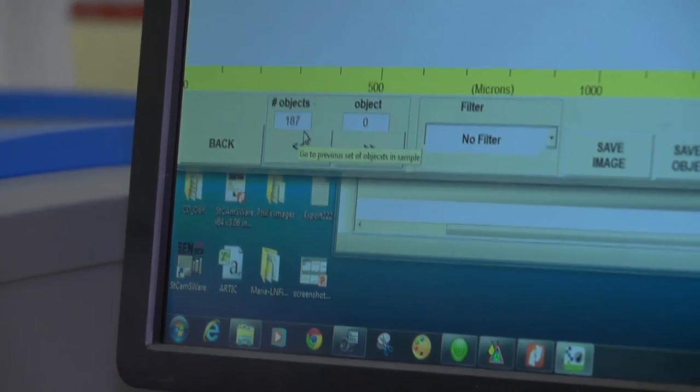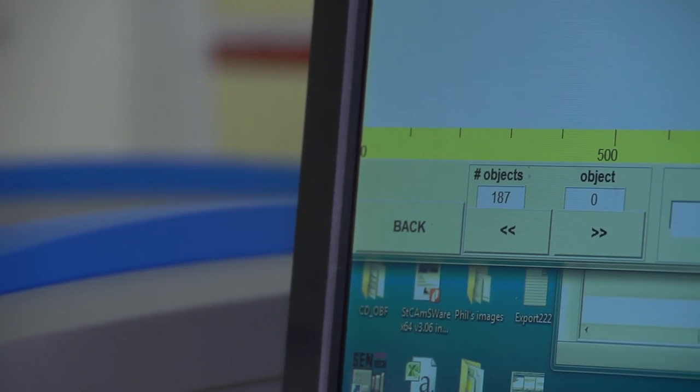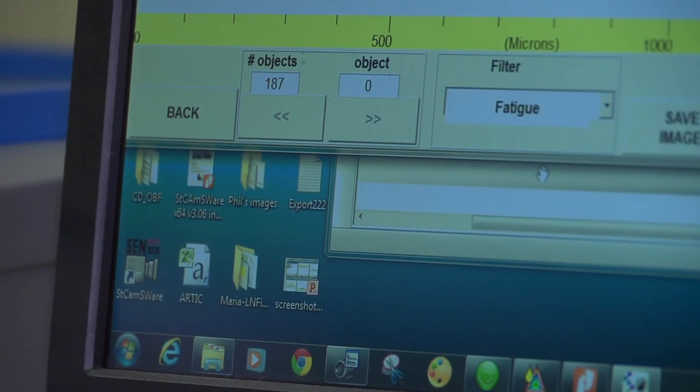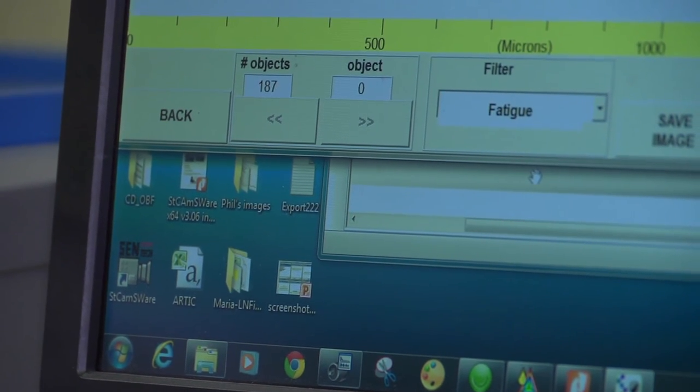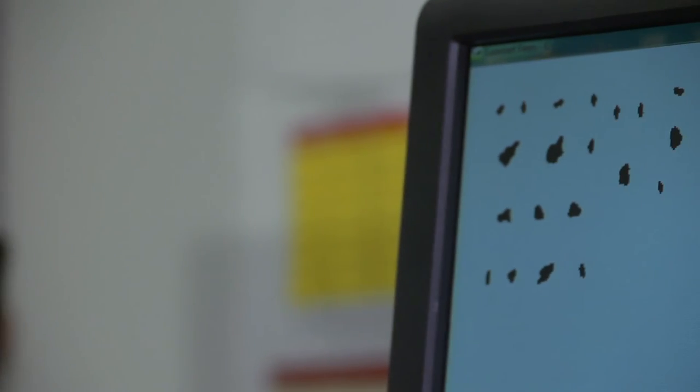And then you can actually filter if you're only interested in fatigue wear. You can get an image of all the various platelets. That's the typical traditional shape of what a fatigue particle would look like.